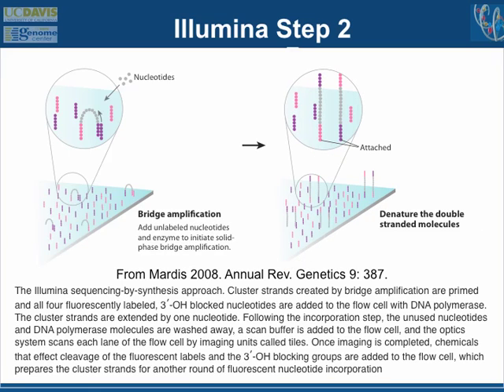And then you run this thing called bridge PCR, or bridge amplification, where the details don't really matter that much. In essence, what you're doing is making copies of your piece of DNA using the local primers that are physically around that piece of DNA. You get these little bridge products where the piece of DNA is extended to another primer, and you run this PCR in physical isolation as opposed to on these emulsion products.